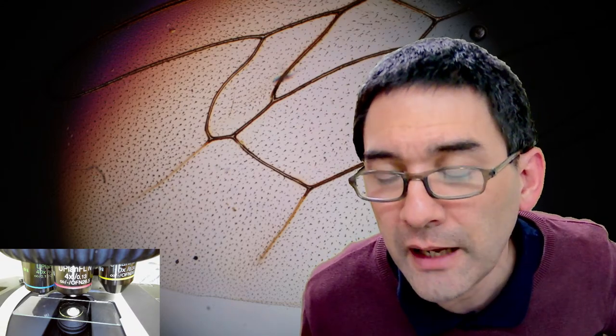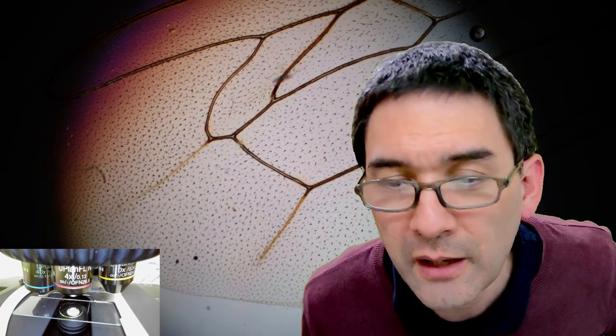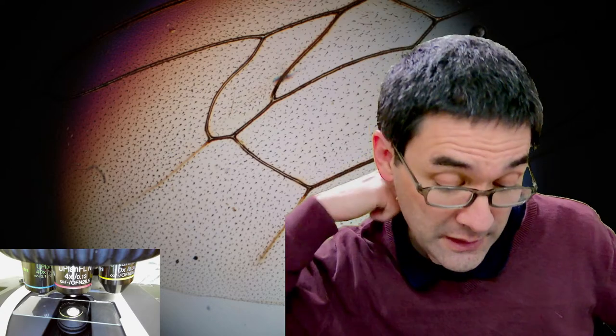Okay. Yeah, I have unfortunately missed most of your live stream. Don't worry, it will go online. I have recently used some UV resin to mount down a feather I found, and it worked extremely well. Do you have any thoughts on that? Yes, I know that there are some mounting media that solidify when you put ultraviolet light on them, or at least I've heard about them. I know that there are some nail polishes that solidify when you put UV light on them.